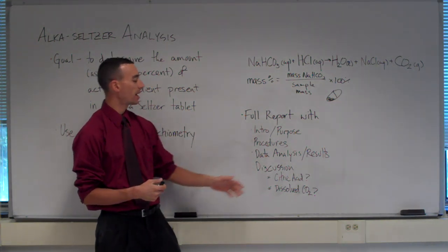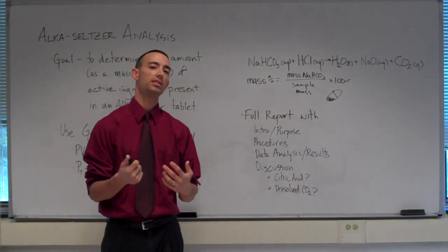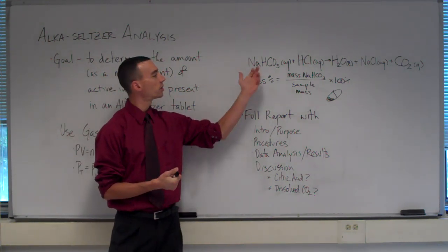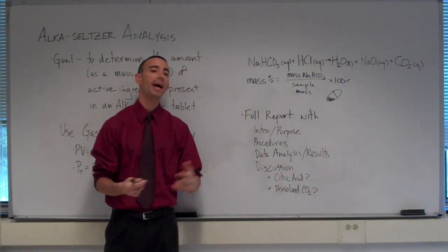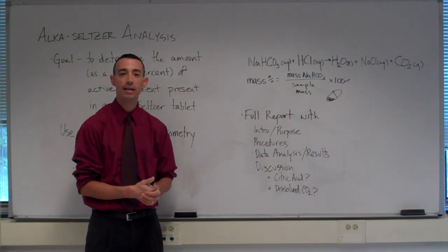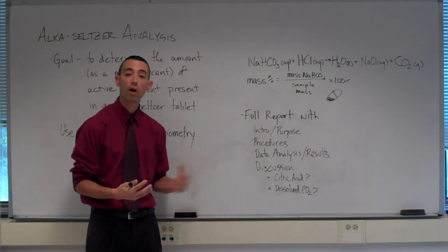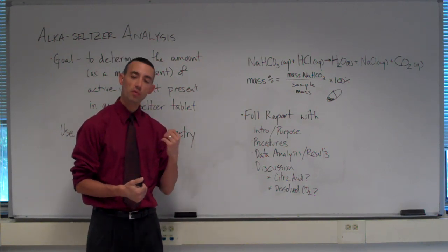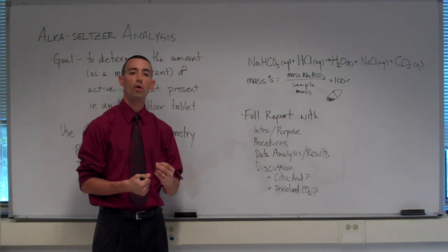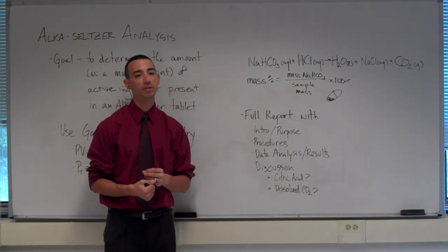And finally, your report should wrap up with a discussion. Discussion. What do you think? Was this a successful outcome? Is this a good way to analyze the sodium bicarbonate content? Feel free to pass judgment, so to speak, or provide an opinion on how the experiment went. Yes, you do need to think about what went right or what perhaps went wrong with the experiment. This is a very important component of any scientific work. The ability to be critical first of yourself and your findings before someone else has the opportunity to do it.